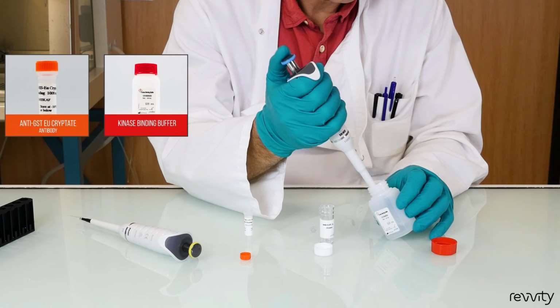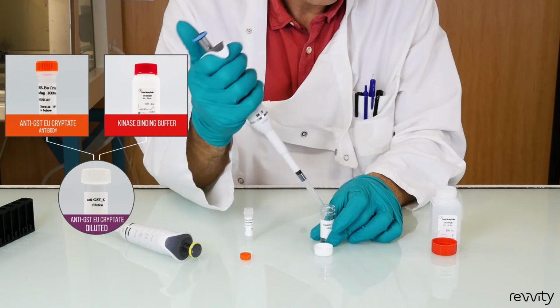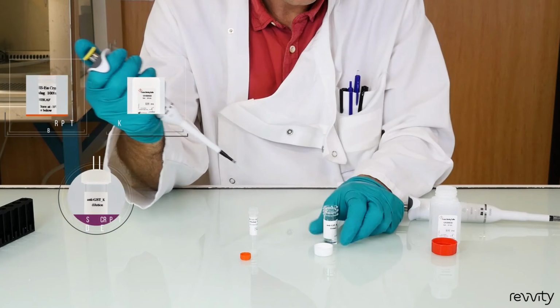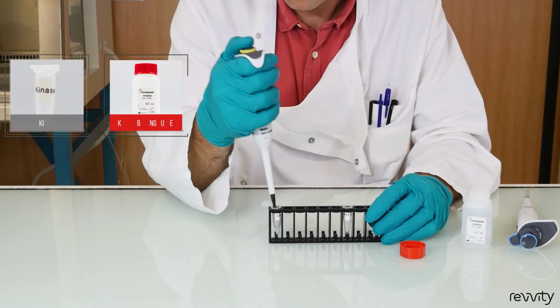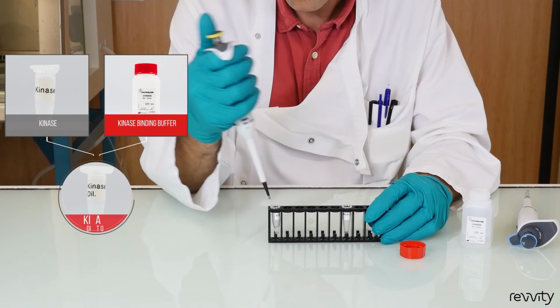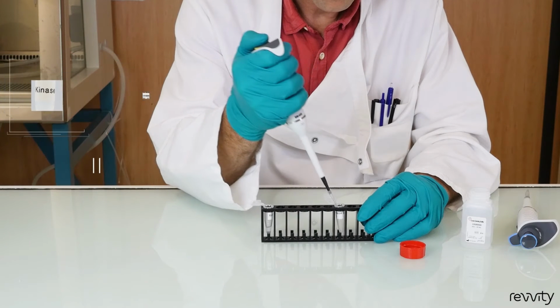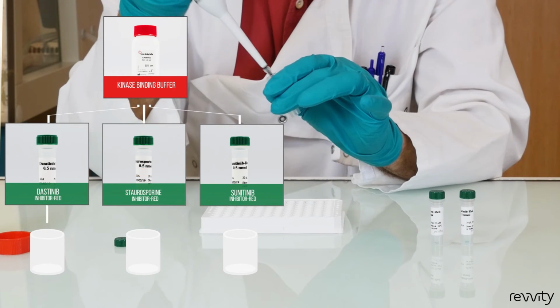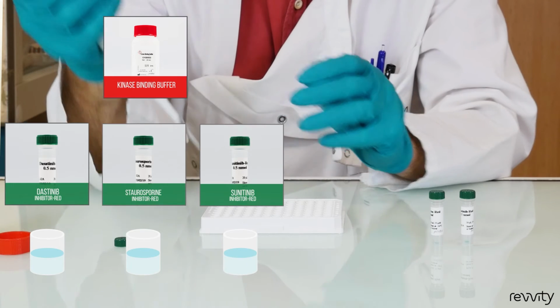Start by preparing your working solutions. Dilute 100-fold the anti-GST europium cryptate antibody with kinase binding buffer. Dilute your stock solutions of GST tagged kinase in kinase binding buffer to 20 nanomolar. Dilute 25-fold the 25 micromolar stock solution of each inhibitor red with kinase binding buffer.